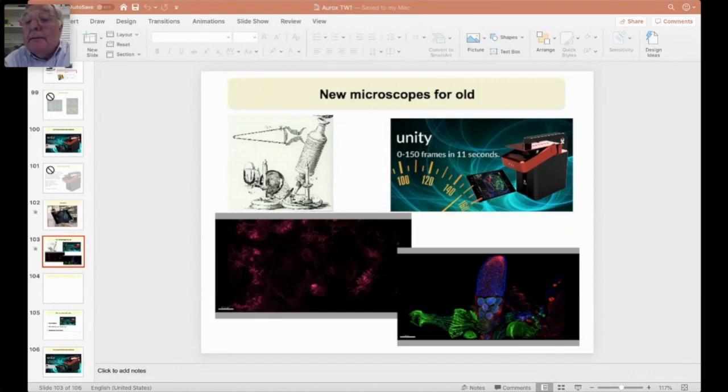Kirti Prakash is asking, why didn't confocal get a Nobel Prize? Well, I wasn't on the committee, so I can't answer that. He also says he heard that the Nobel Committee didn't like the outspoken Minsky. Didn't Minsky effectively drop this as soon as he invented it? I went to his house once, and I think he claimed to have built something which he couldn't find. I believe that to be true. But it wasn't what he was particularly interested in. Minsky certainly is outspoken, and he's not everyone's cup of tea, but I can't believe that was the reason.